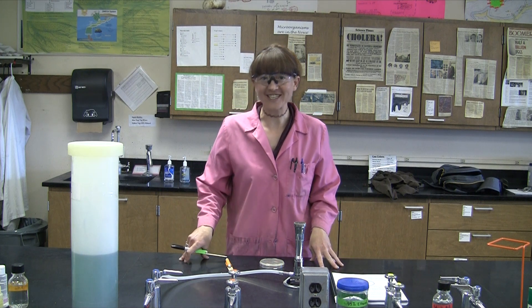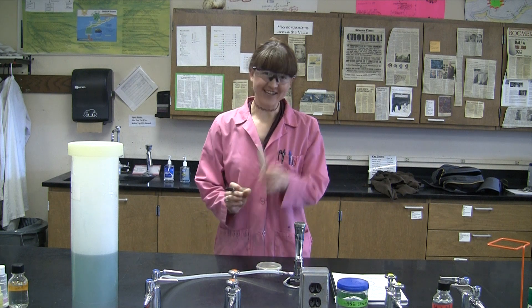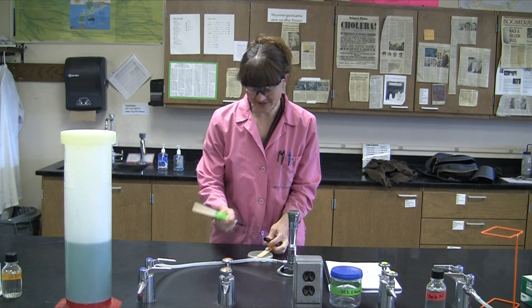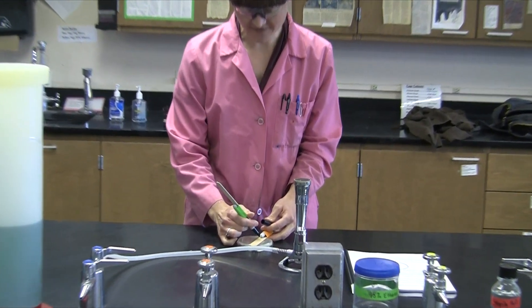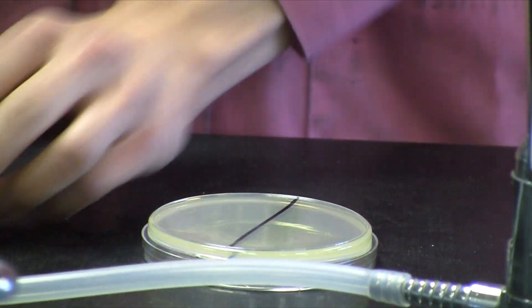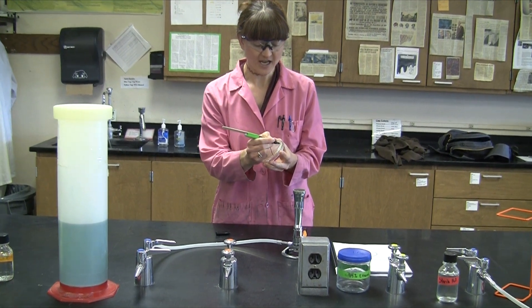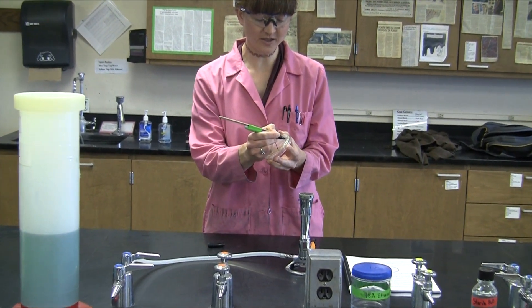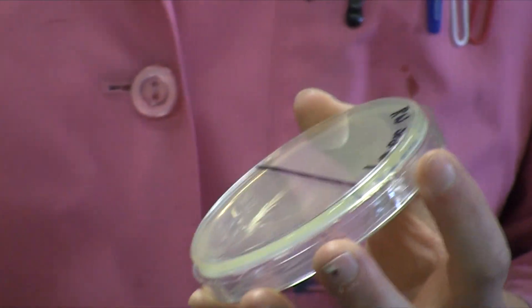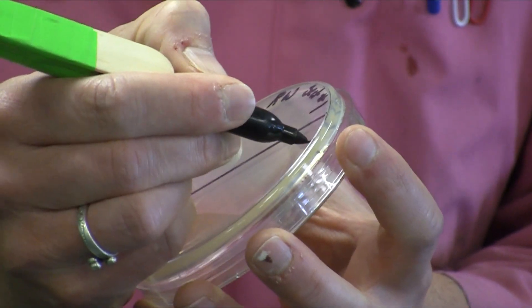Today we're going to be performing the hand washing experiment. Start by labeling your plate — I like to use this as a straight edge. You'll be splitting the plate into two halves: one will be your treated half and one will be your untreated half. Go ahead and label your plate with your name and section number, or at least something that will allow you to recognize it. You can also call it your hand washing plate.